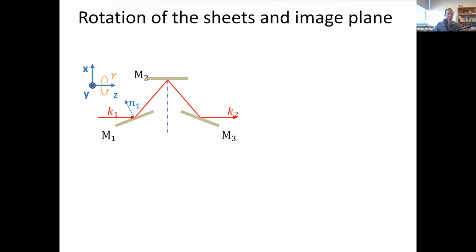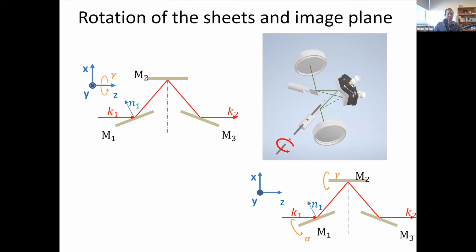We still didn't want mechanical rotation, so a naive idea that I proposed in the lab early on is, well, let's build something like a K mirror, have these roof mirrors, essentially a pair or maybe more of them, stationary at different angles that correspond to the rotation angles we would like, and put in 2 Galvo mirrors that could then switch paths between those. That should do the same thing, right? It looks similar to this thing here, with the caveat that the rotation angle of this one is a little bit different than here, so it's not exactly the same.